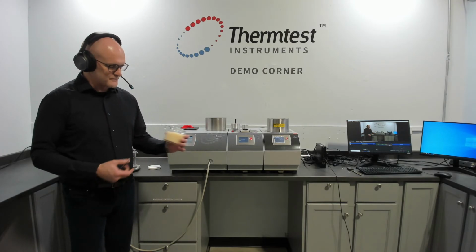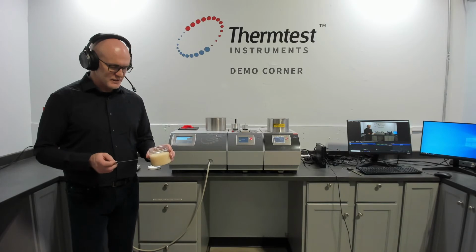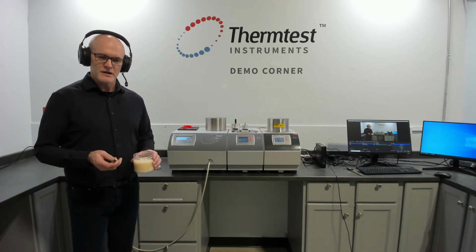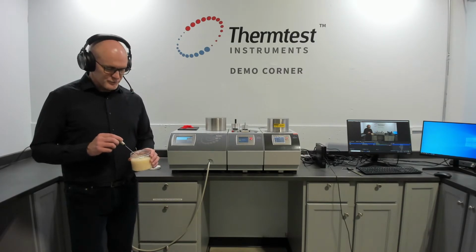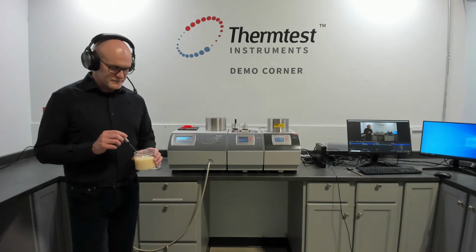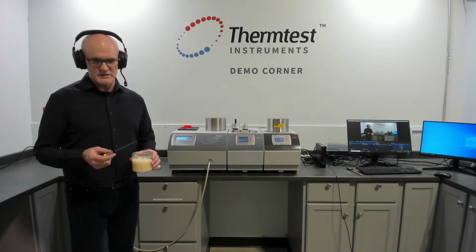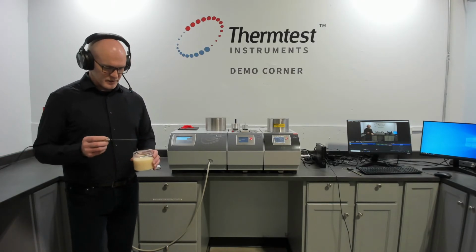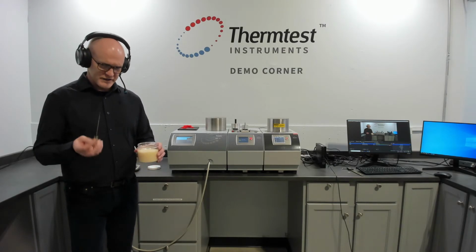So this is a high-density polyethylene sample. A little bit of background on this: we were approached in 2018 by several polymer companies, rather companies that are involved in thermal simulation software used in developing the parameters for injection molding. We were approached by a few of those companies to develop an improvement over the transient line source.